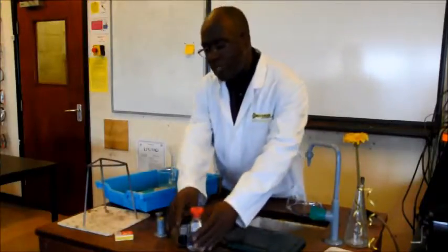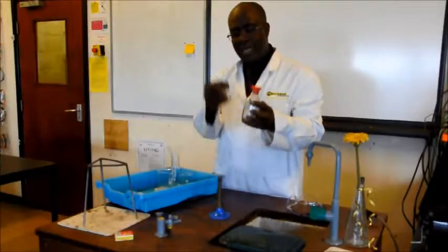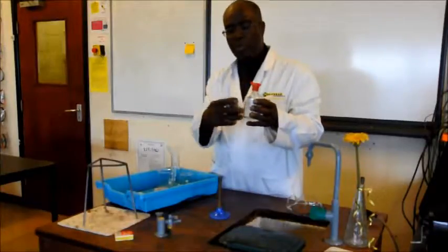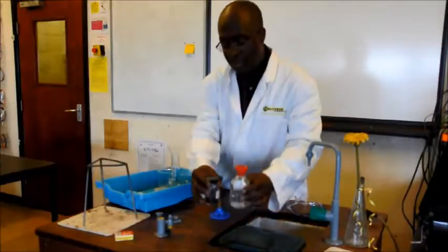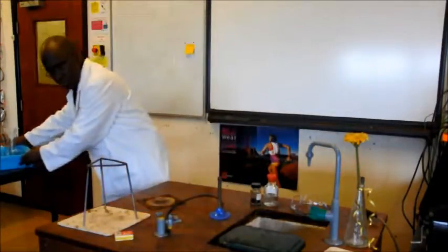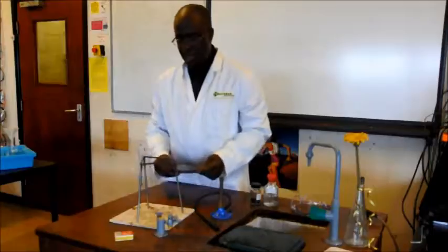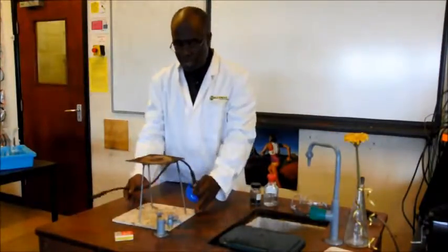The reaction doesn't actually happen when the sulfuric acid is cold, so it's necessary to heat the sulfuric acid and then add the copper oxide until we've used up all the sulfuric acid. So the first stage is to warm the sulfuric acid. To do this, we've got our usual heating equipment: tripod, bench mat, gauze, Bunsen burner.